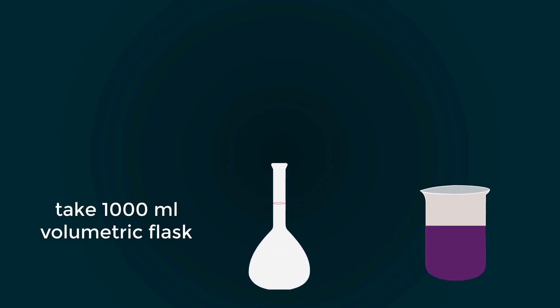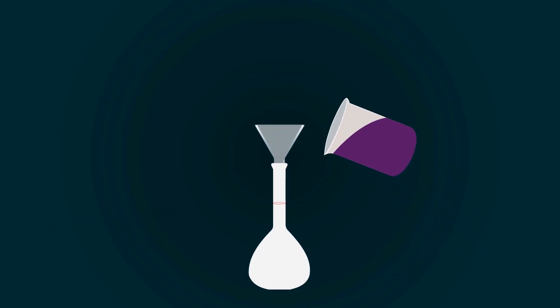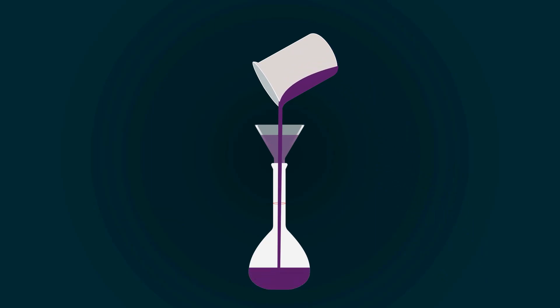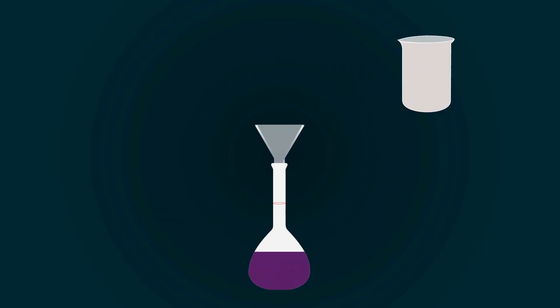Now pour all the solution into the volumetric flask with the help of the funnel. You have to fill the volumetric flask up to the 1000 milliliter mark. For that, you have to add more distilled water.